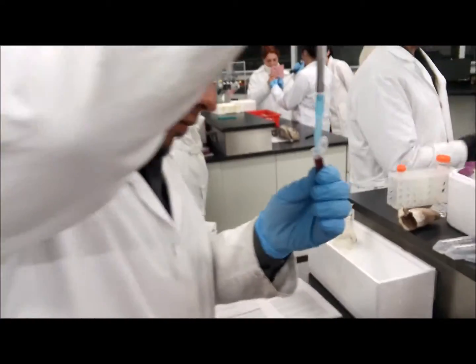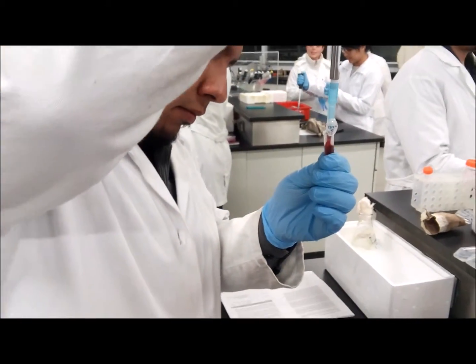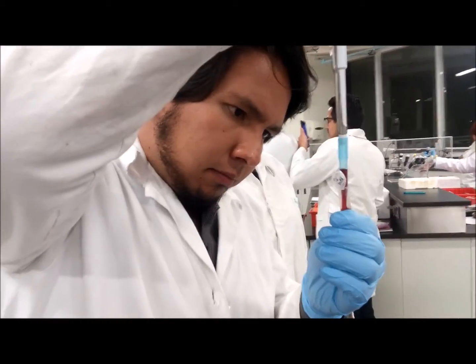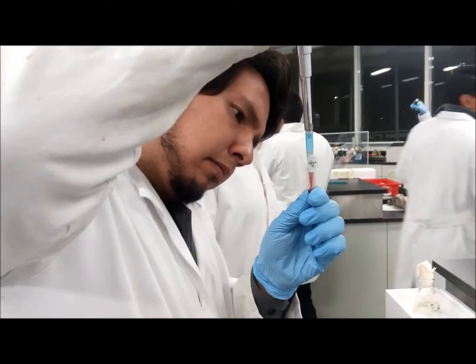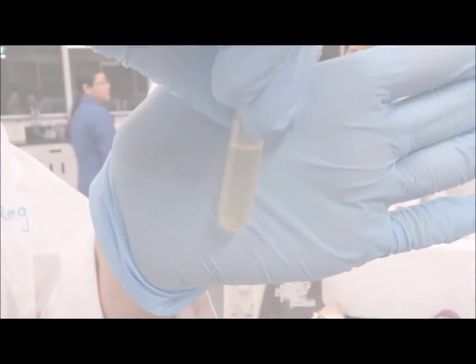For the purification, the first part is the precipitation of DNA. The DNA is insoluble in alcohol, so it is precipitated in cold ethanol and recovered by centrifugation. The supernatant alcohol takes the rest of the salts away. Wash the pellet with alcohol and centrifuge again.